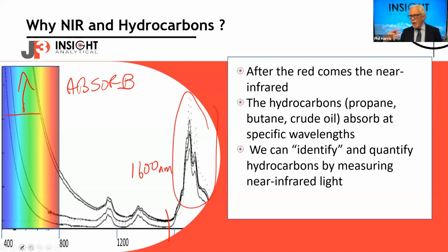And it's those shapes and patterns that let us do a qualitative analysis, if you like, what hydrocarbons are there, and a quantitative analysis, how much of them is there. So it allows us to both identify them and also to quantify how much of them are there.